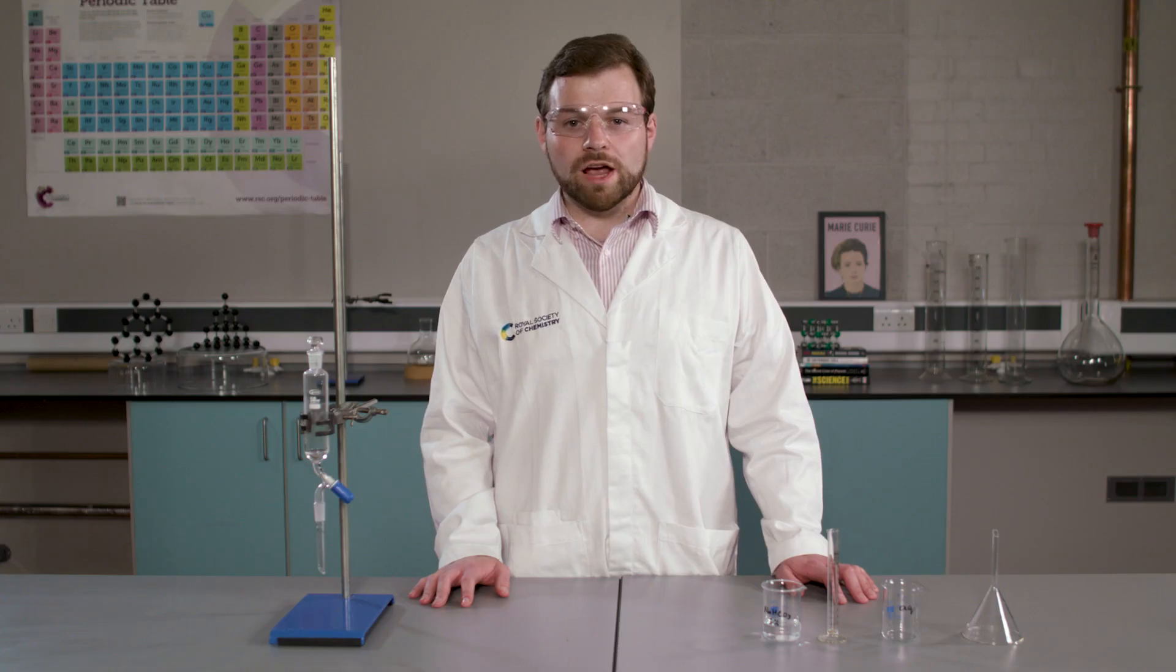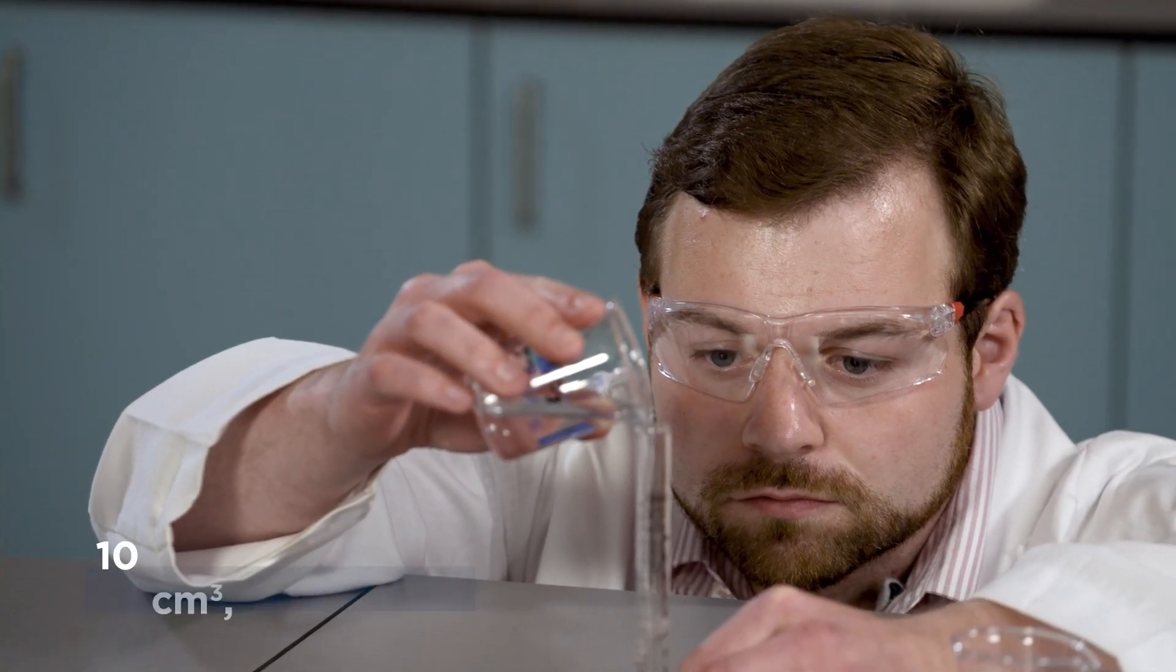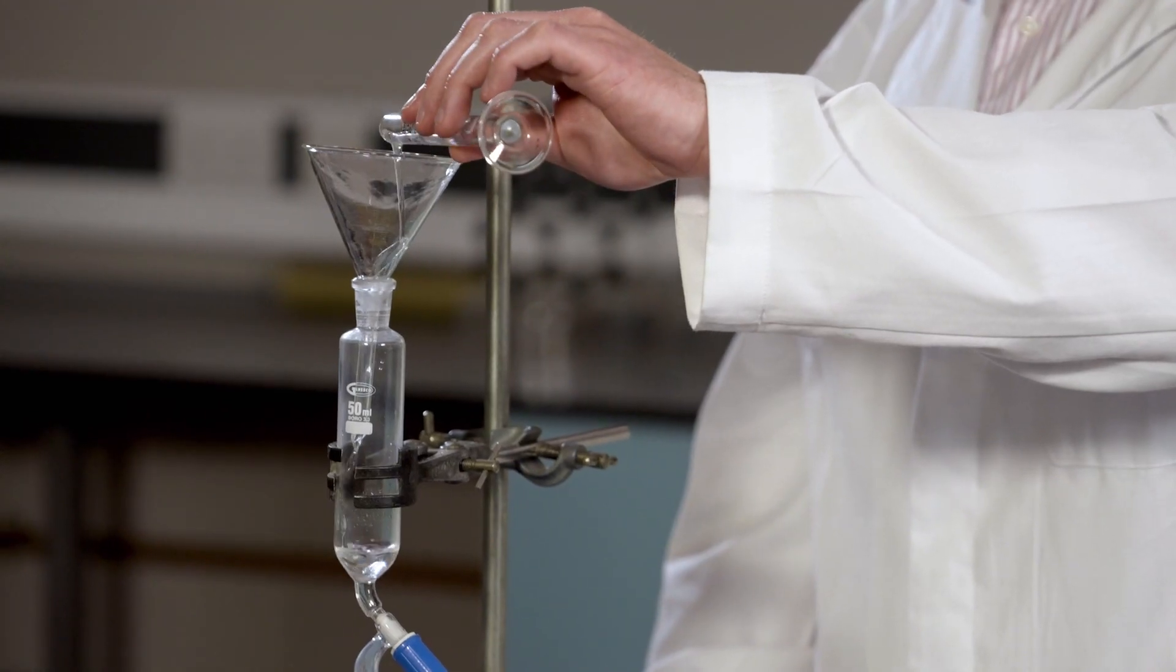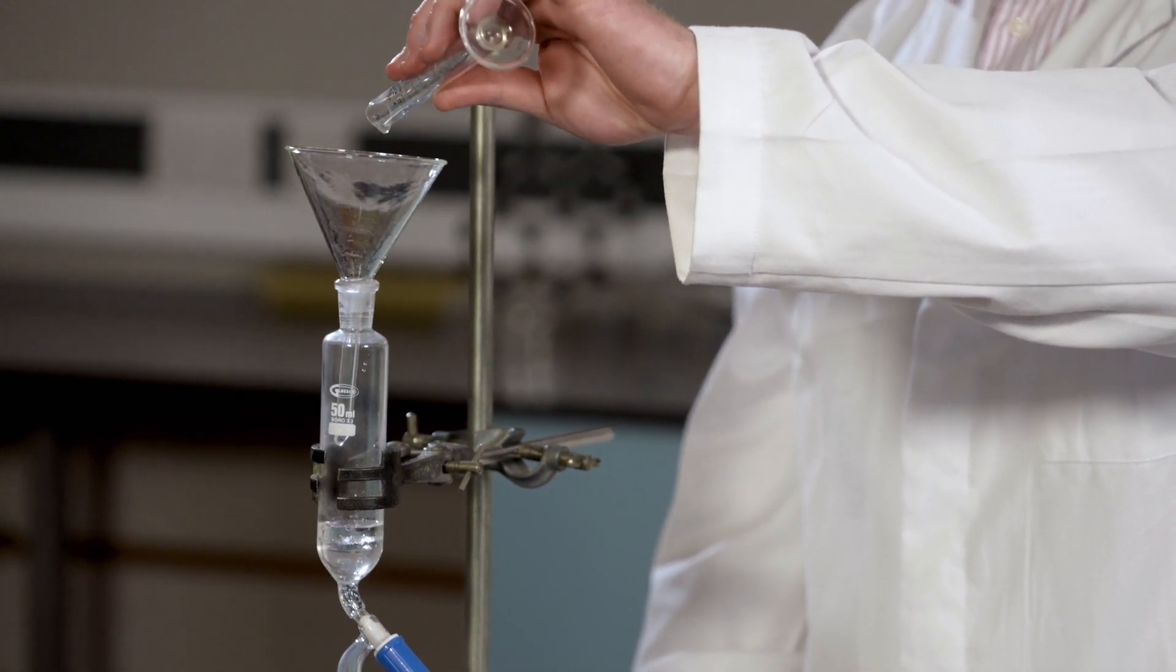There may still be unreacted hydrochloric acid in our sample. To remove this, we can react it with an alkali and separate it using a separating funnel. To do this, I'm going to measure out 10 centimeters cubed of sodium hydrogen carbonate solution and add it to our separating funnel. Note, I'm using a funnel every time I add a solution to our separating funnel.